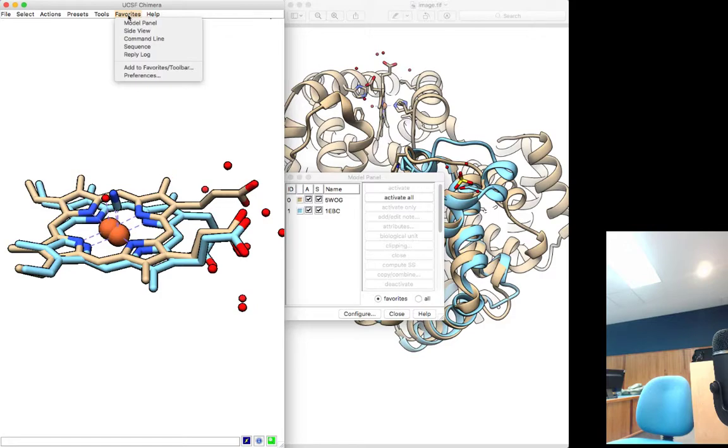So, Chimera is a very powerful tool. As I told Paul just a second ago, it's free, but it has many, many more applications than what I showed you. This is just the general and was to illustrate that sequences and structures can be analyzed together. You can technically use this one just to perform sequence analysis, for example, or only structure, or many, many other things. But for the time being, I want to just cap it with what I showed you.